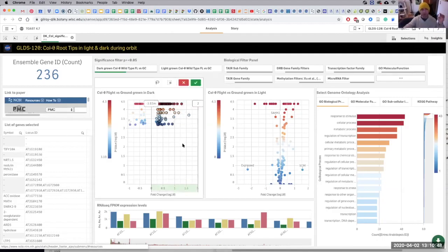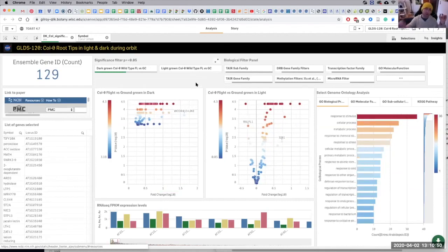So I'm just gonna select the genes that went up. I want to know the genes that were activated. If this was the case, I truly did just flip a coin. You could also talk about the genes that are suppressed, but I wanted to go up.